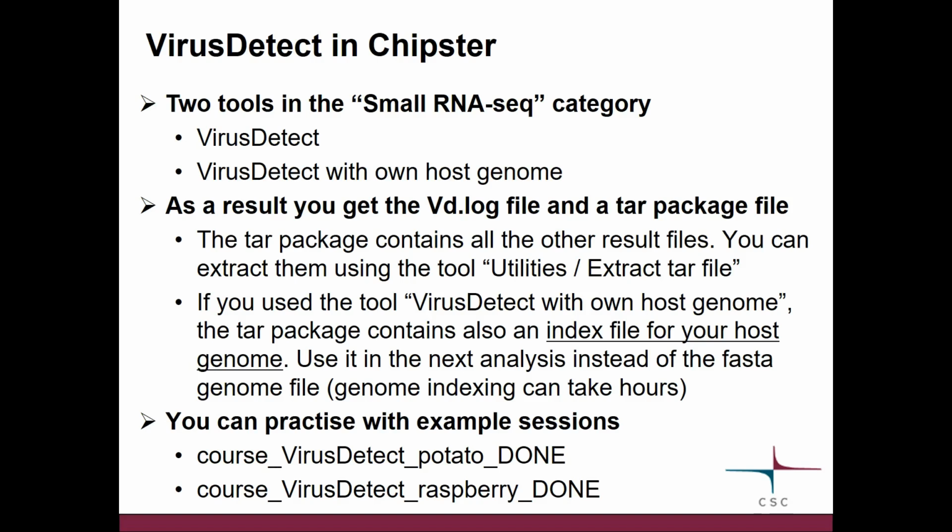So you probably don't want to spend several hours on this every time you run a different sample. So what we have done is that when you run this tool and you get the tar package, in that tar package we have put the index file that was made during that run for your host genome, so that next time you don't need to give the FASTA file for your genome anymore. You can give this ready-made index file, and that means that your analysis will run much faster.